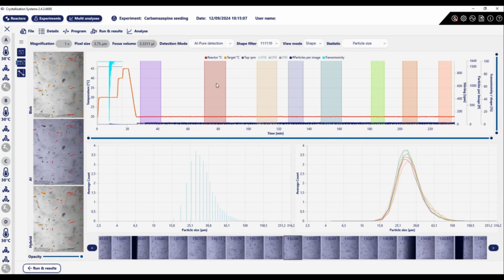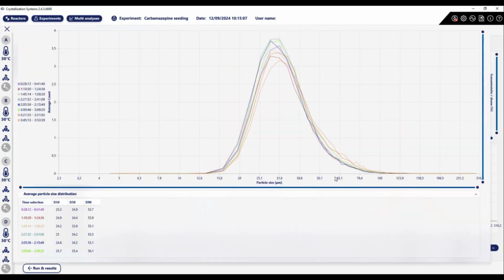Once you do all your analysis, the data is projected in the graph on the right. If we click this, it will become larger. We can then click on and off data in order to show how this changes over the course of the experiment. Initially, there looks like nothing's really happened.